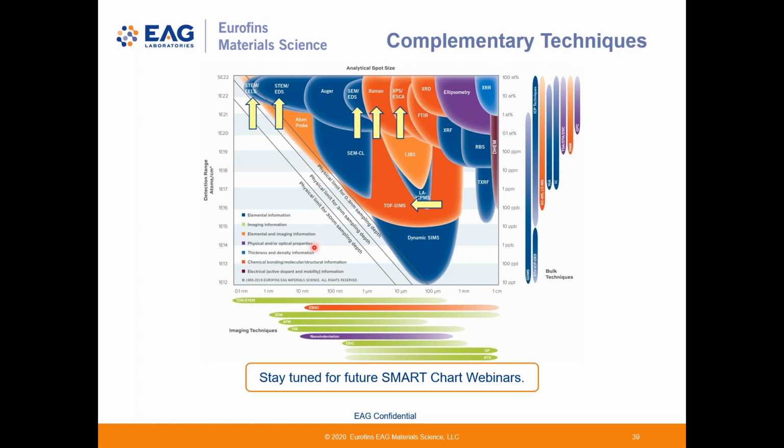And then finally, we do lots of analysis with TOF SIMS, which has an excellent detection limit of parts per billion and a fairly decent spot size of a few microns. We've also combined Auger analysis with almost every other technique in this chart, but I really don't have time to discuss all the merits of these possible combinations right now.